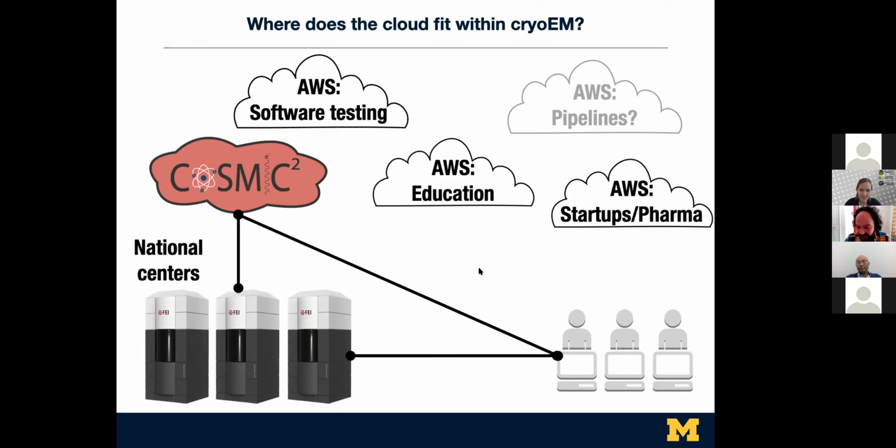If there's something unique that tomography users would really use, we could totally do that. It's just a matter of letting us know or telling us why it should be in there. I've hesitated because some tomography steps, like bead tracking, are really interactive, and that's harder for us to do. But if it's like run some job, we can easily do that. So it's not hard for us to add new tools.